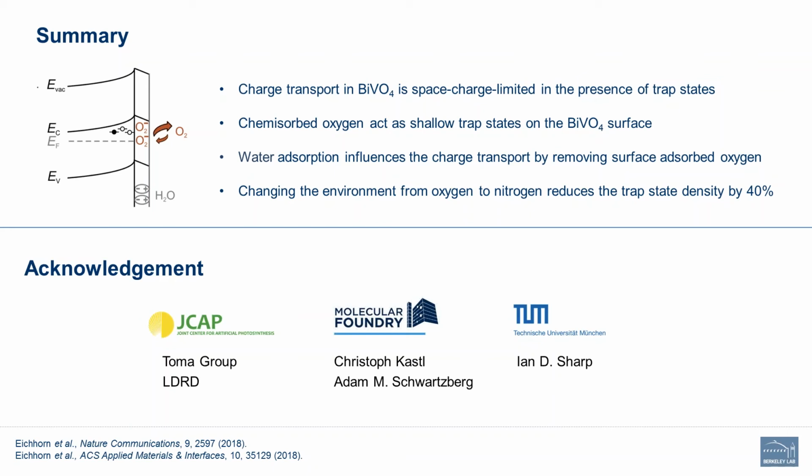So one possibility with BiVO4 is using, for example, the scanning electrochemical microscopy module and just putting BiVO4 in an electrolyte, and then we can also measure IV curves, or we can do something like Nellis presented two months ago.